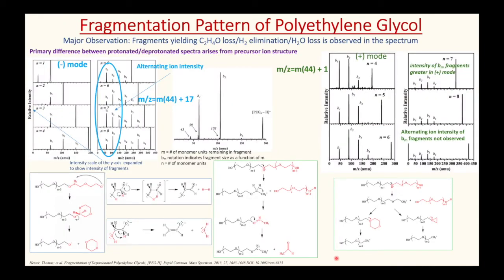All right, so in this slide, I want to talk about the fragmentation pattern of polyethylene glycol in the negative and the positive mode, and to look at the differences in their fragmentation patterns.